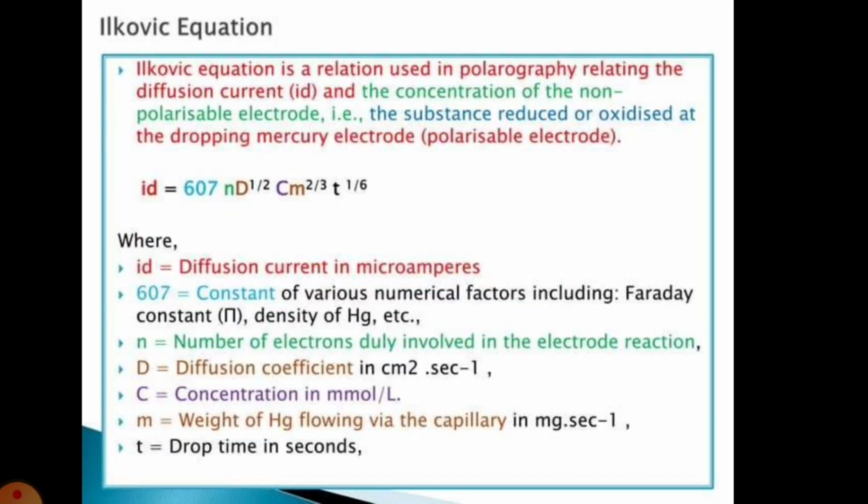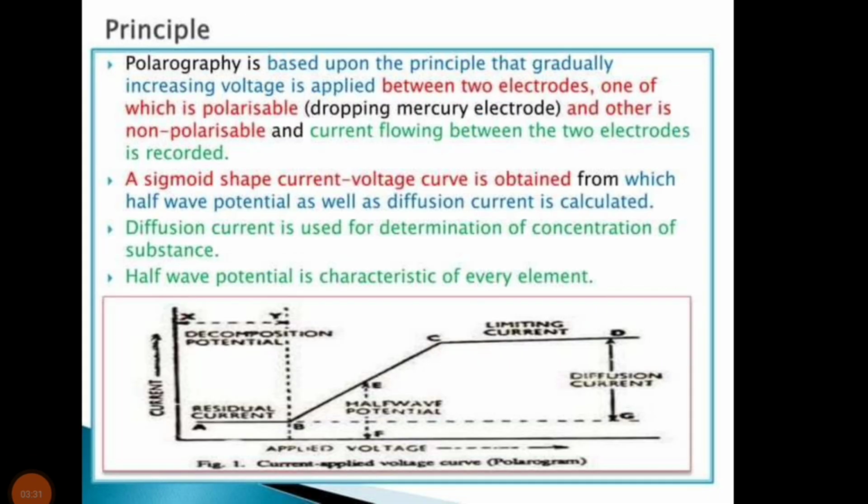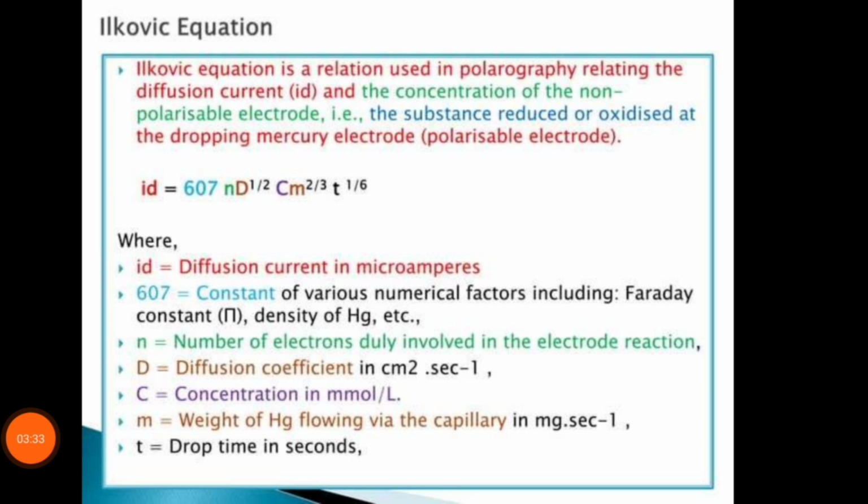In today's class, I discussed the Ilkovic equation for polarography and diffusion current estimation.